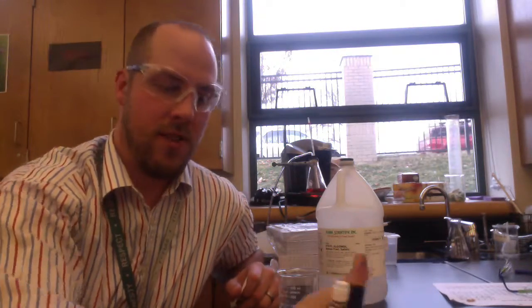I wanted to record this video just to give you a quick idea of the lab that we started on Friday, and you guys will continue on Monday. It's a lab called a chromatography lab. Chromatography just means the splitting of colors, or this kind of study of colors. We've got some chromatography paper here, and you need a pencil.